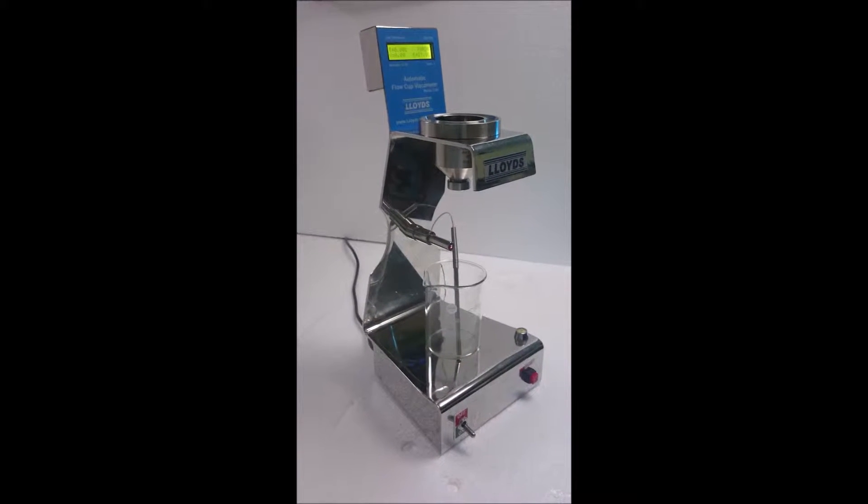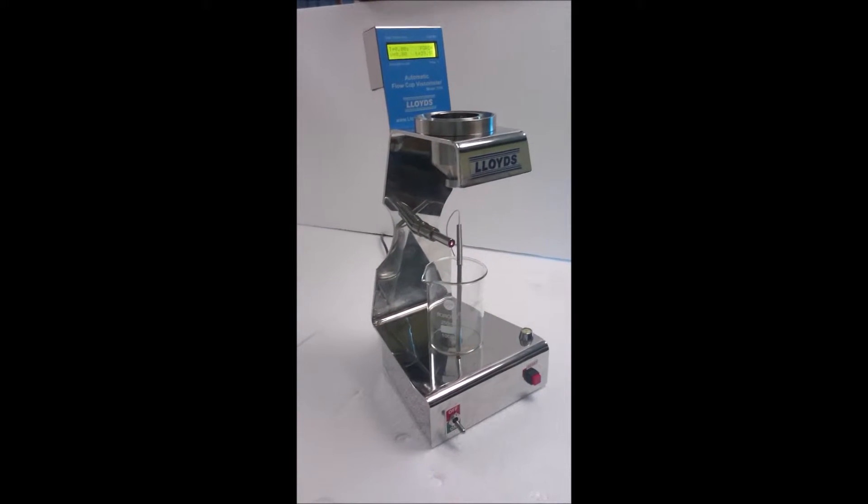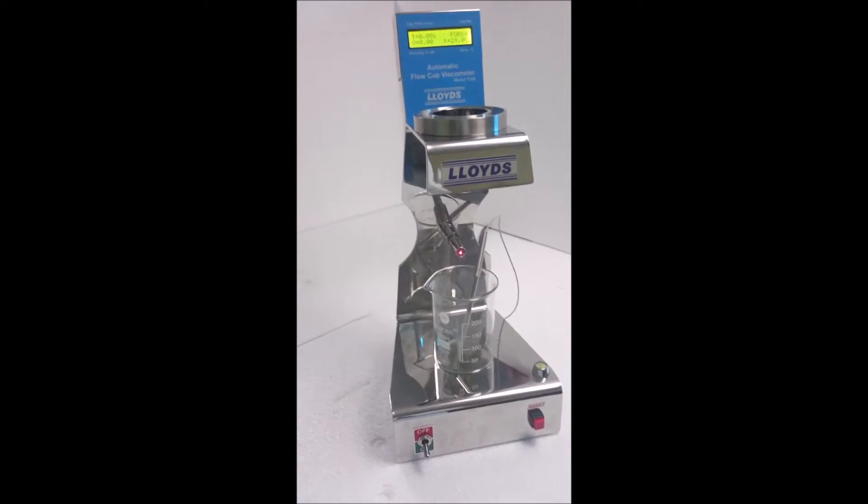Welcome gentlemen, this is Lloyd's Automatic Cup Viscometer which automatically measures the flow time of almost all viscosity cups available worldwide as per relevant international standards.